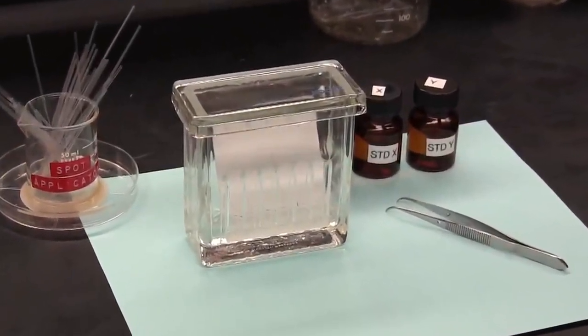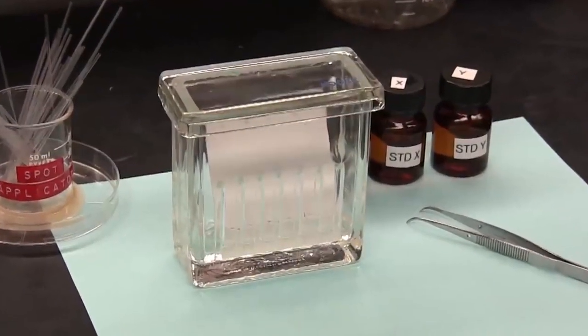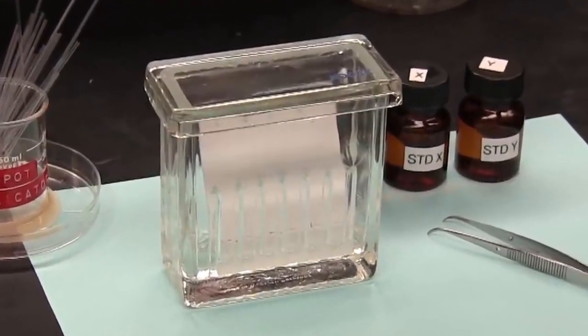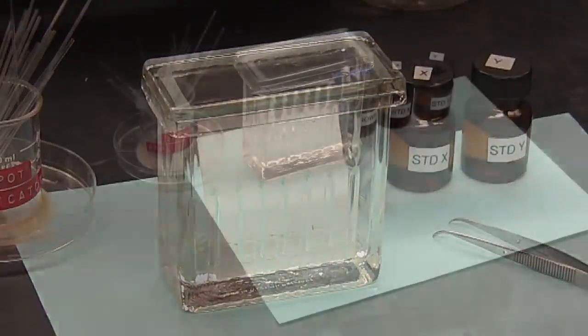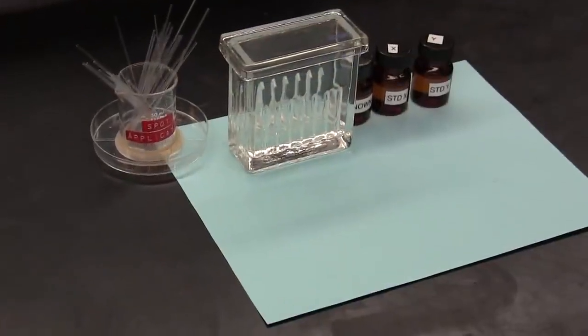The separated components can be identified by comparing how far they travel along the plate relative to reference material, also known as standards. Let's take a closer look.